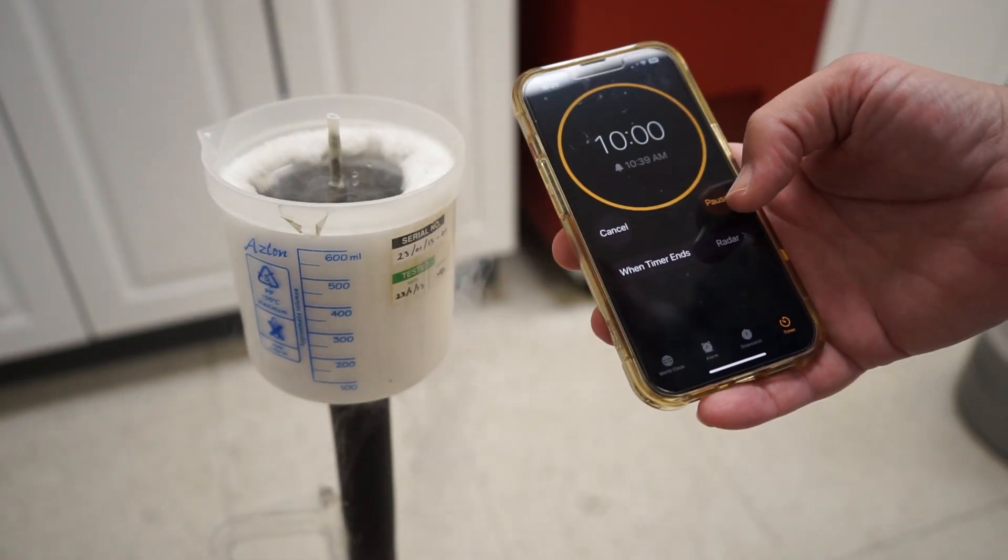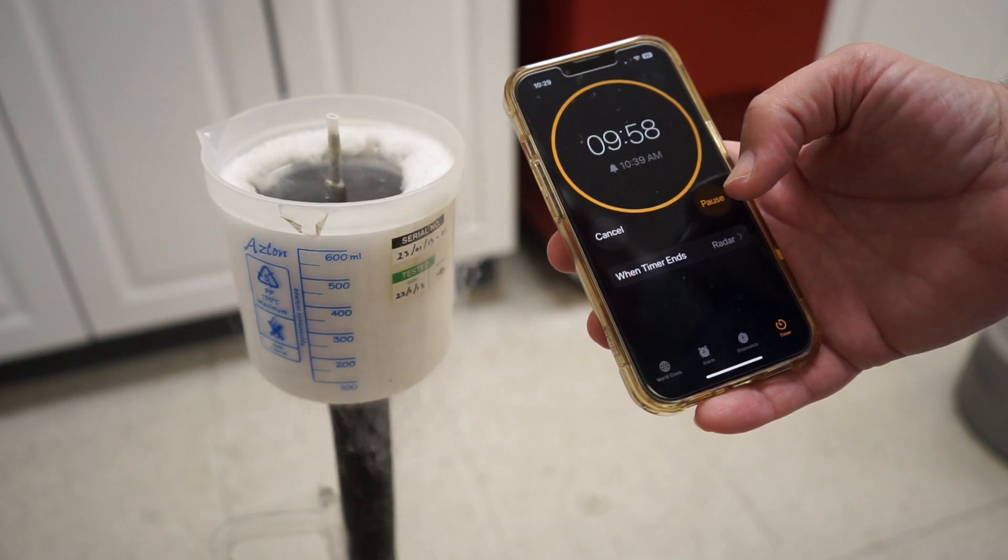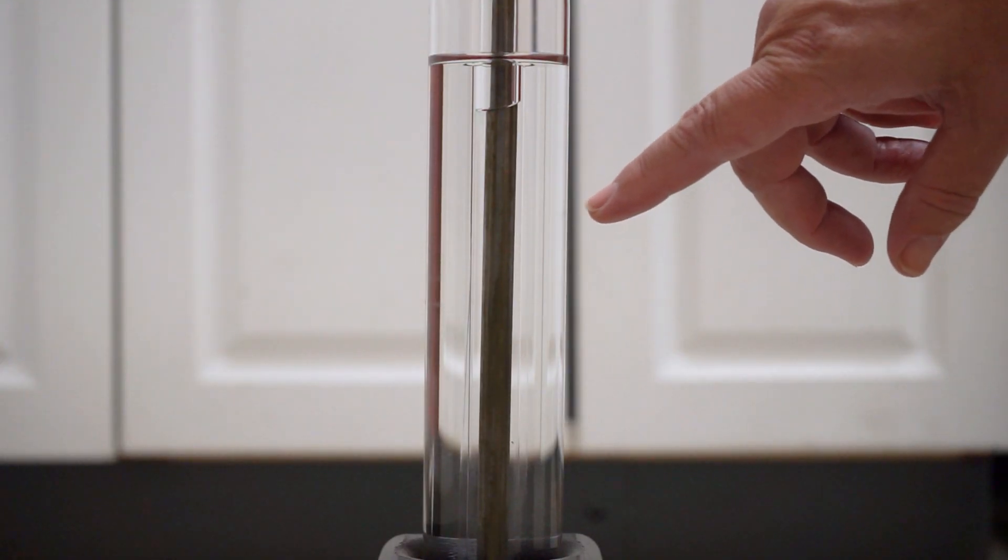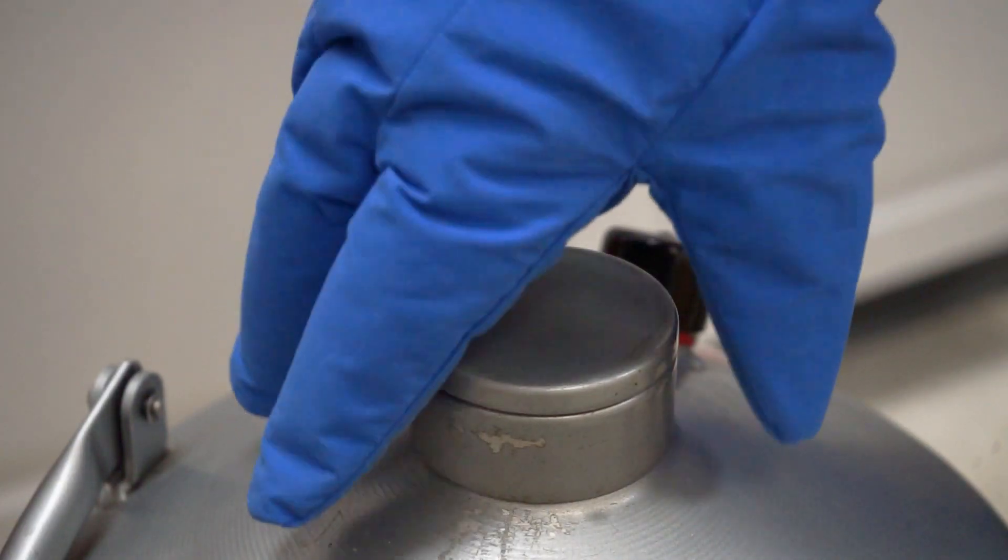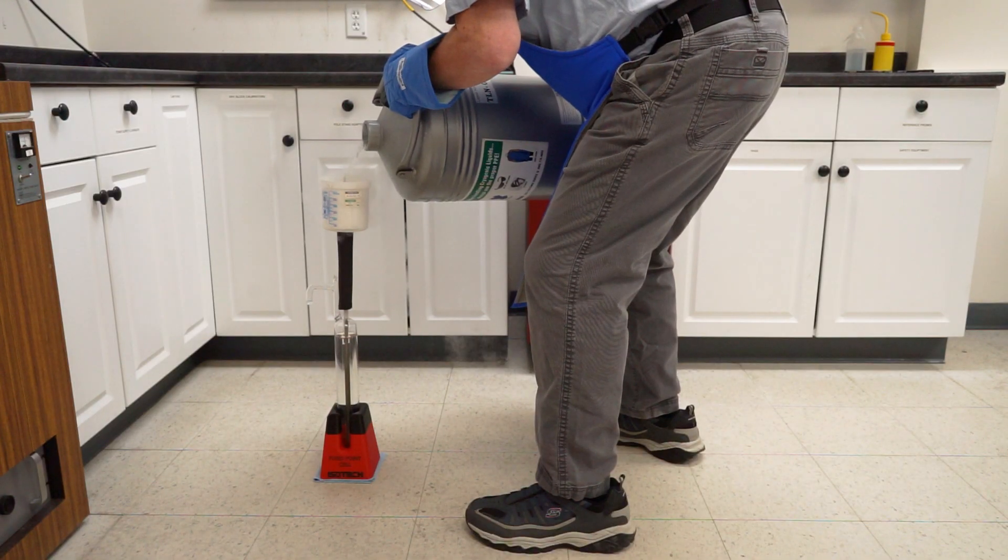It is possible that ice can begin forming as soon as the first pour, so be on the lookout for that as well. After 10 minutes has passed, we can refill the mantle maker with liquid nitrogen.